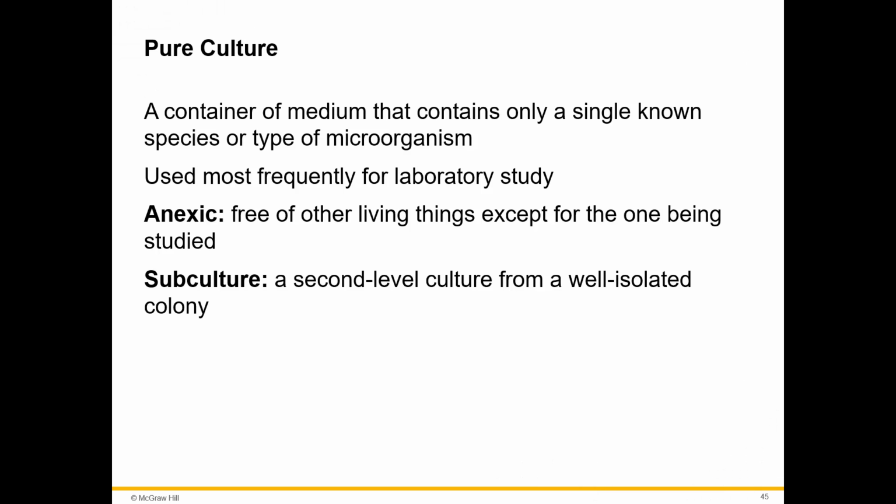A pure culture is a medium that contains only a single known species or type of microorganism. It's used most frequently for laboratory studies. Axenic is free of other living things except for the one being studied, and a subculture is a second level culture from a well isolated colony.